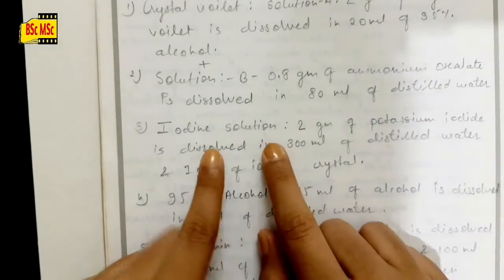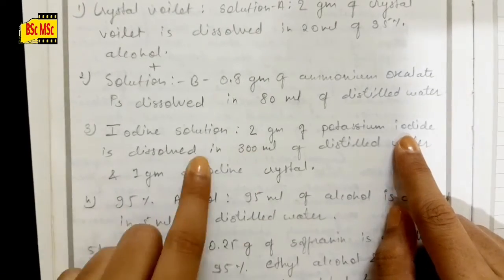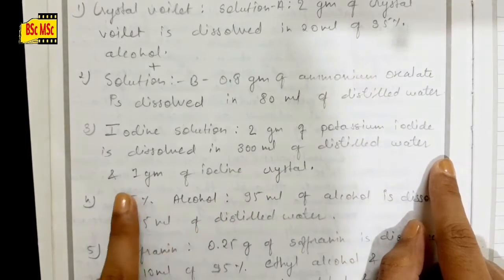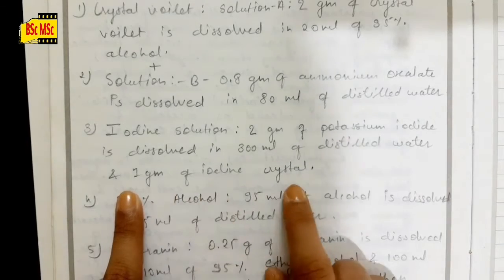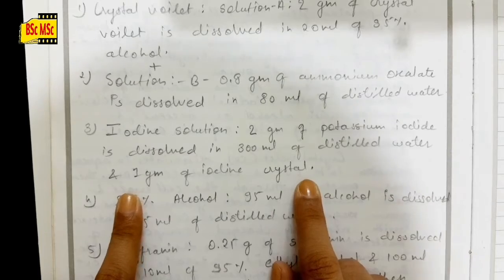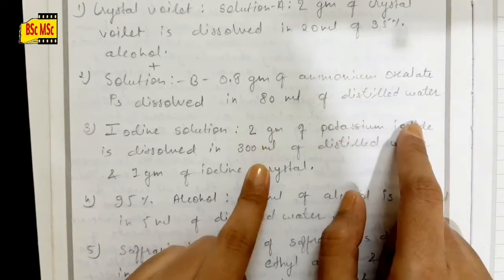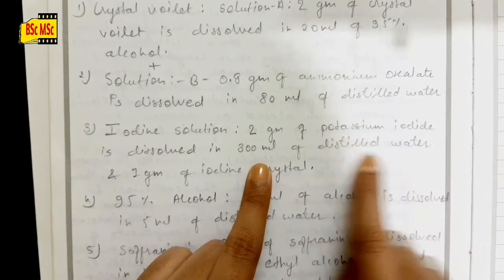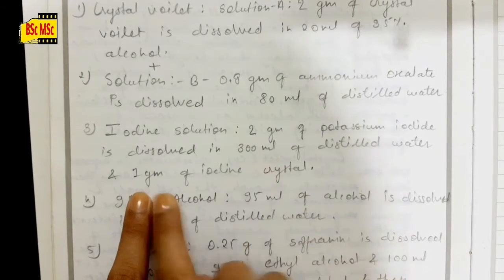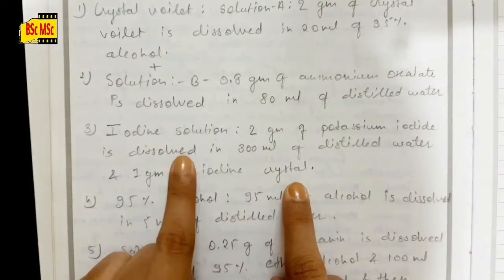Then the iodine solution: take 2 gram of potassium iodide and dissolve it in 300 ml of distilled water, and 1 gram of iodine crystal. So first you need to take 2 gram of potassium iodide, which you will dissolve in 300 ml of distilled water, and then add 1 gram of iodine crystal. So your iodine solution will be ready.